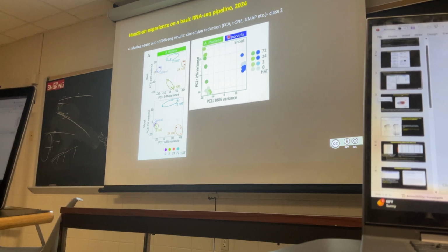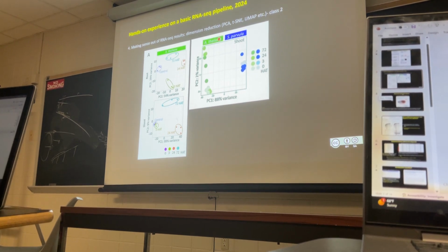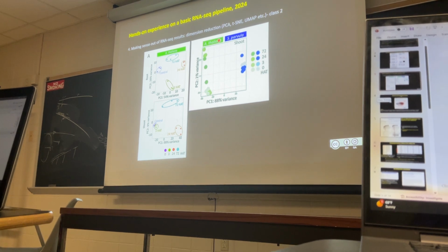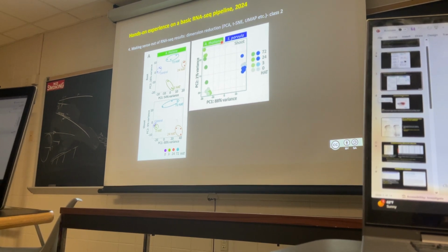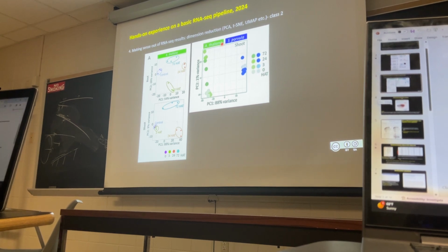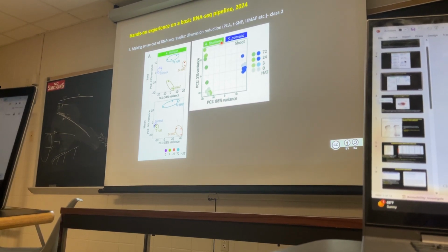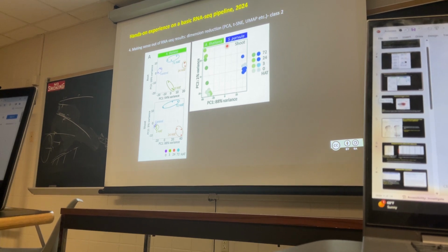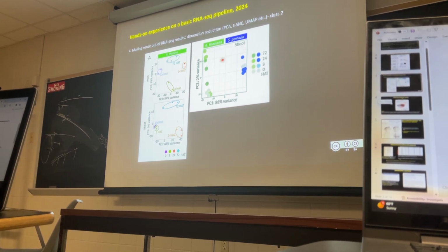If you have multiple species, you can do that as well. If you are comparing different genotypes or samples of human, or different plants like rice, maize, or other crops, you can put in the ortholog genes, the most similar genes between the species, and create the principal component analysis.